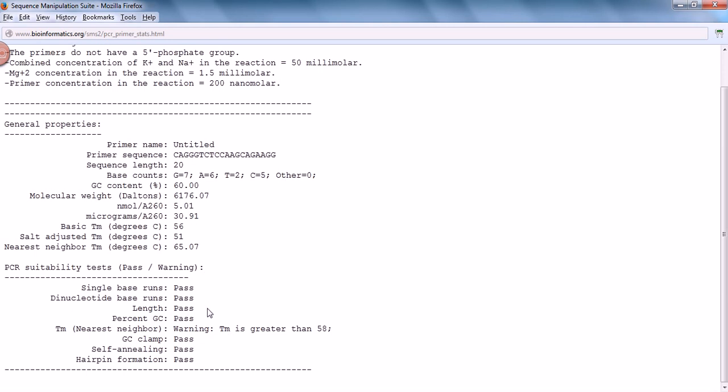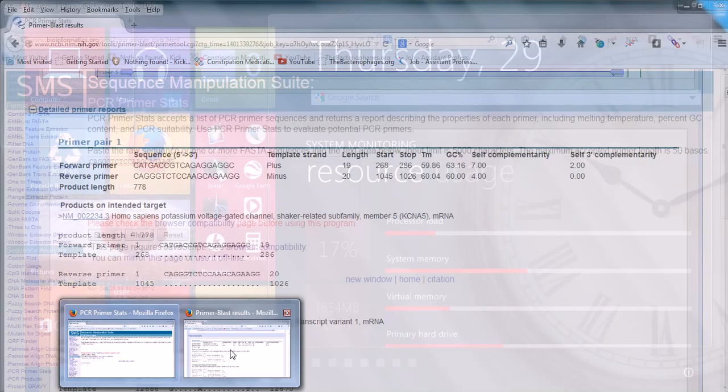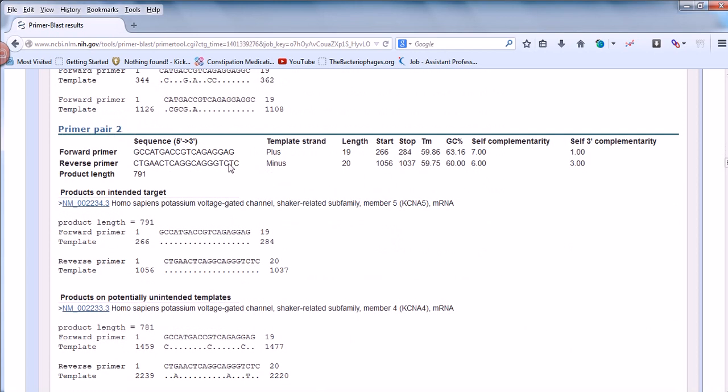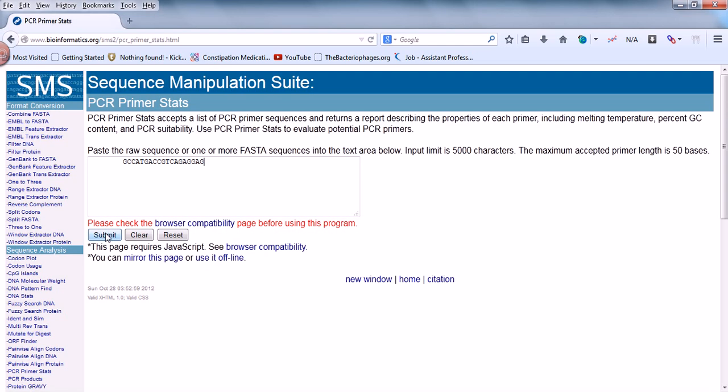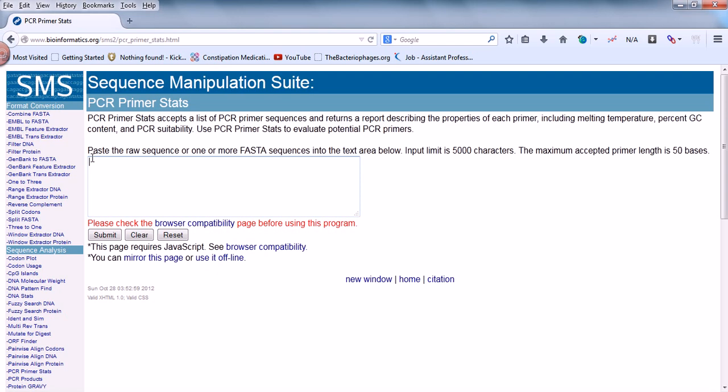Now let's select another one. We have a reverse primer but we need to find another forward primer. Let's check this forward primer. Let's take this as a forward primer, put the value here, and submit. We get it again - it passes four and has four warnings. There are chances of hairpins, so it's bad. We can't select that one.